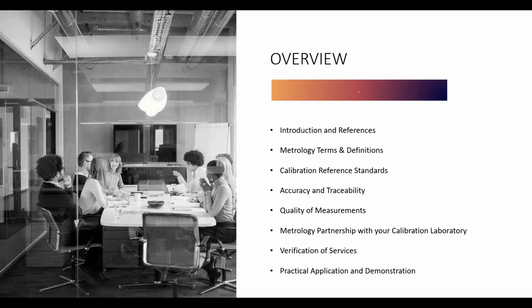We're going to cover some of the terms and definitions we use in the calibration lab, the different reference standards. And when I'm saying standards, I'm talking about the publications and documents, the difference with accuracy and traceability versus your published specifications for your test equipment, some of the different things you can look at for your quality of measurements, and then discuss, again, your partnership with your calibration laboratory.